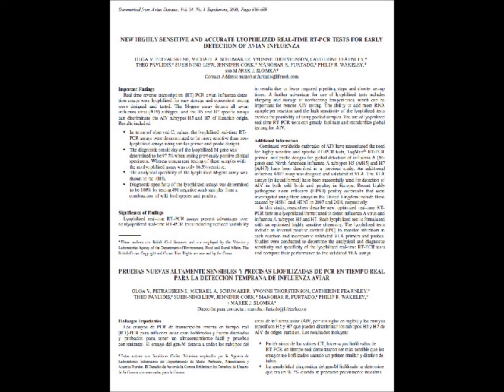Internally, we had done detections to show that we can detect anywhere between 4 to 16 molecules with the lyophilized format compared to requiring 16 to 80 molecules for the corresponding wet assays, which means that we had roughly a 4-fold gain in sensitivity. This was internal work, so to test it out, we sent assays to the VLA, and they looked at testing actual influenza samples and compared the wet assay versus the lyophilized assay.